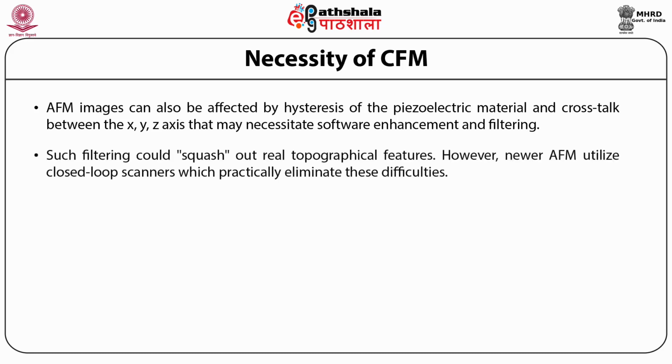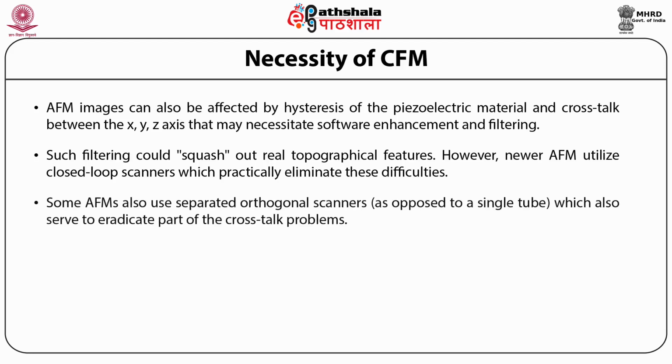Such filtering could squash the real topographical features. However, newer AFMs utilize closed loop scanners, which practically eliminate these difficulties. Some AFMs also use separated orthogonal scanners as opposed to a single tube, which also serves to eradicate part of the crosstalk problems.